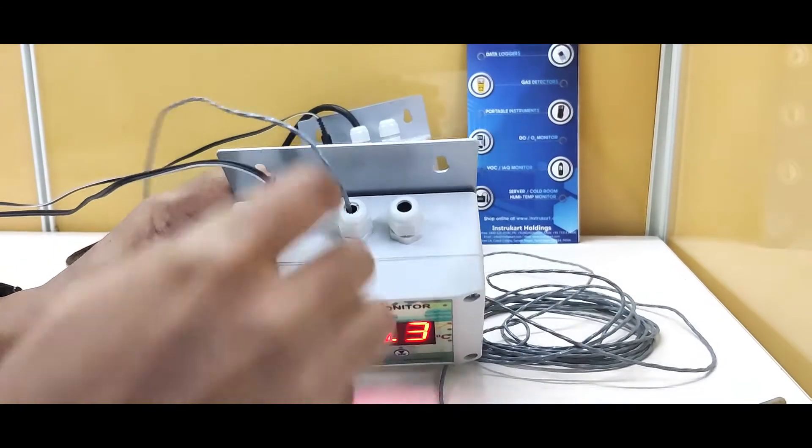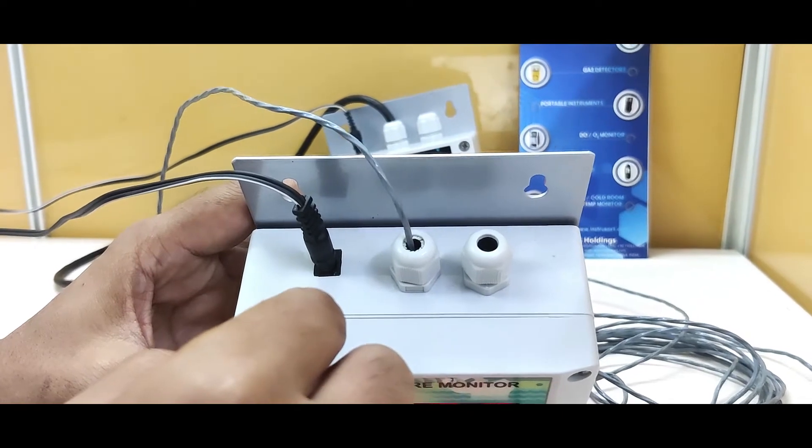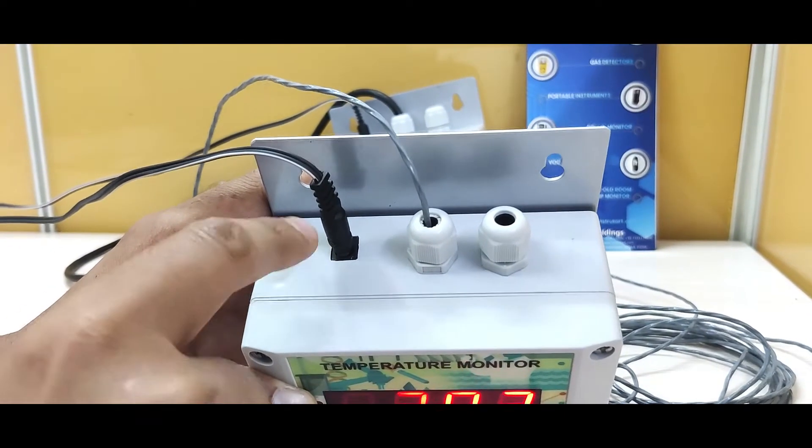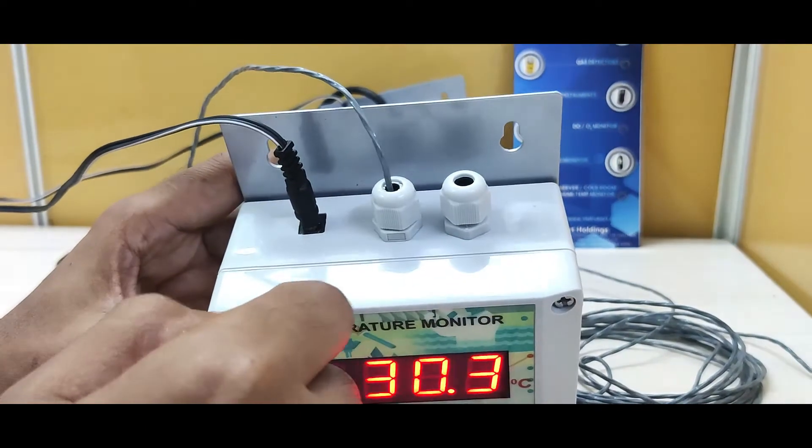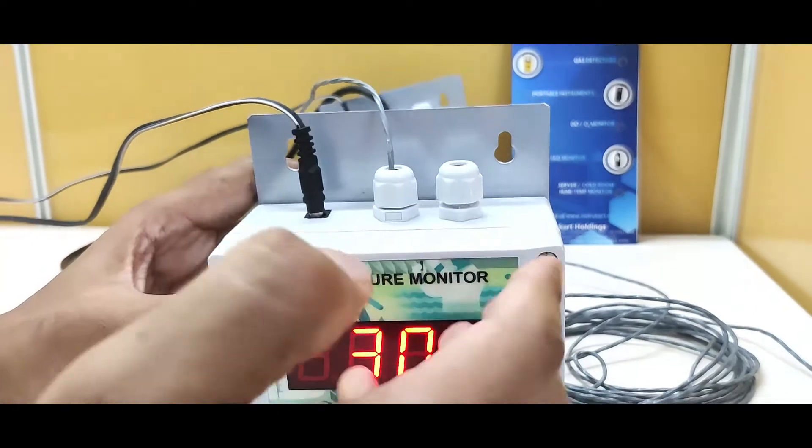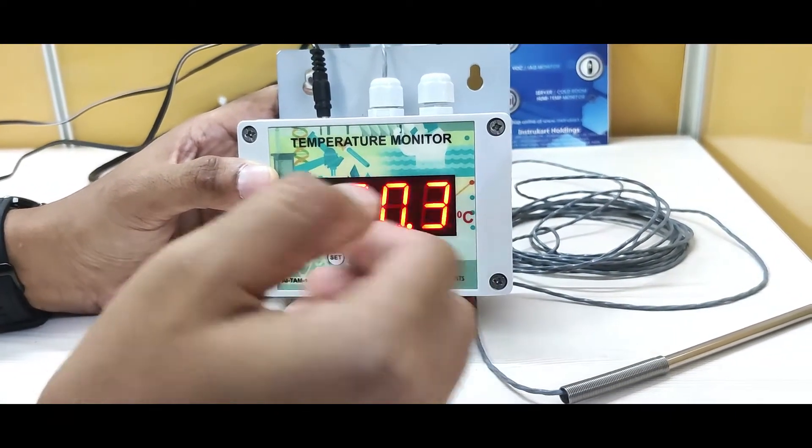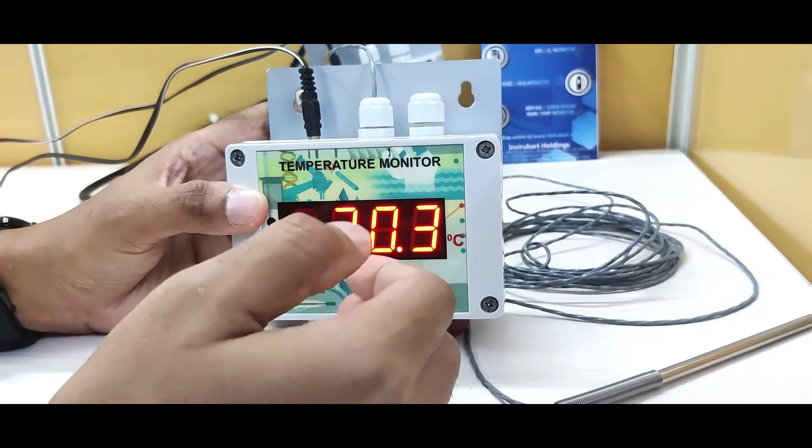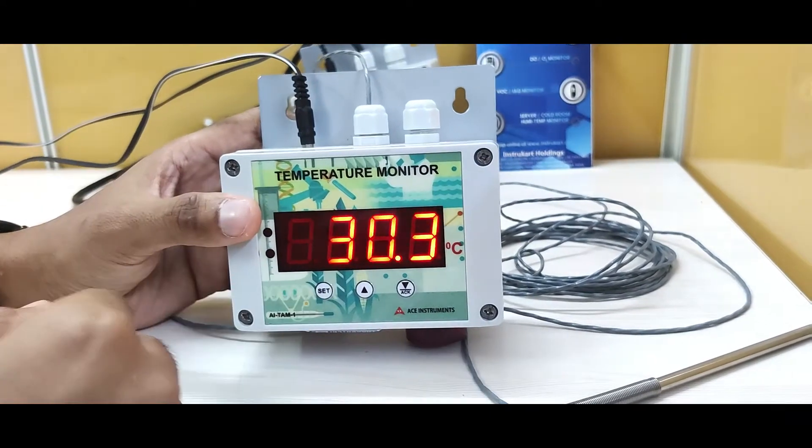On the top you can see this is connected to the sensor. The power input is 12 volts, and the empty port is for connecting to PLC or SCADA using the analog output of 4 to 20 milliamps, or the RS-485 Modbus communication which is also present if required.